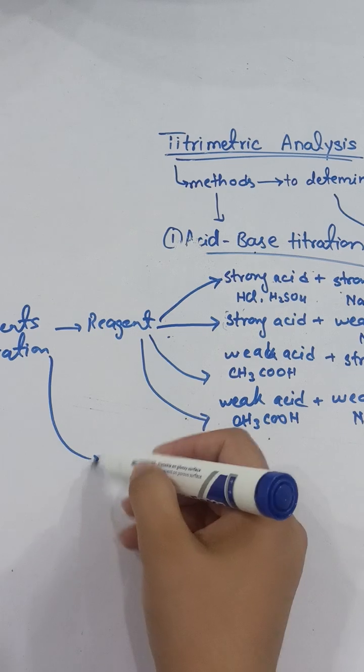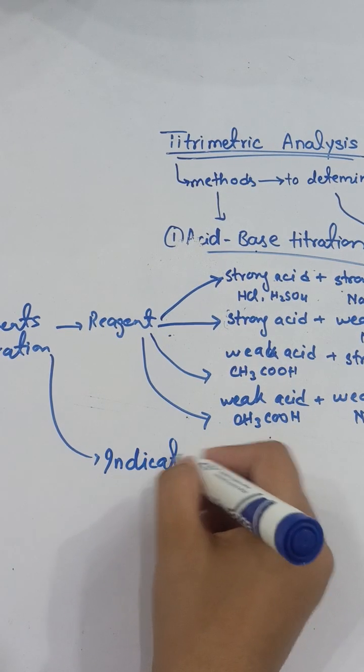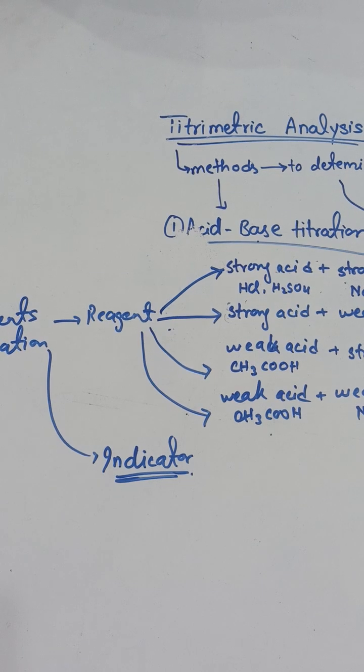दूसरा जो कंपोनेंट है हमारी टाइट्रेशन का, वो बहुत इंपॉर्टेंट है, एंड दैट इज़ आवर इंडिकेटर. अब इंडिकेटर क्या है, हम इसकी स्टडी कर लेते हैं. रिएजेंट मैंने आपको सारे बता दिए, उनकी कर्व्स किस तरह से आती है मैंने सारे बता दिए, उनकी पीएच का क्या चीज़ है वो भी बता दिया. अब आ जाती है इंडिकेटर.